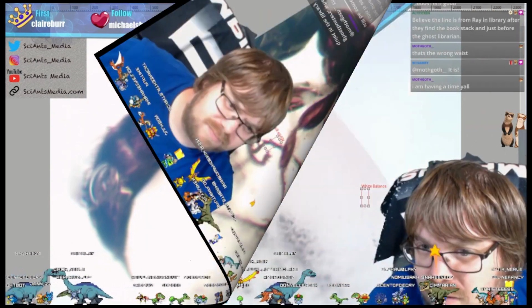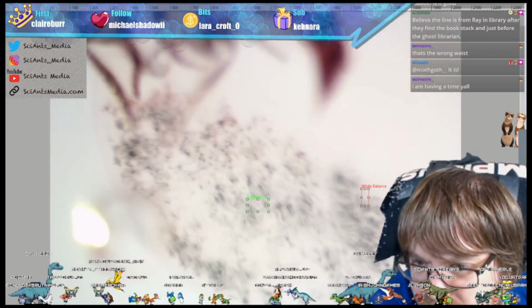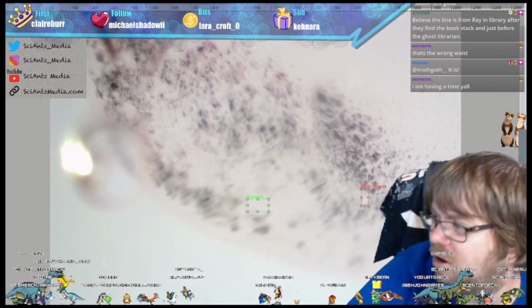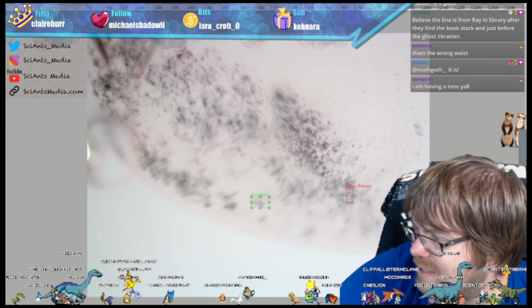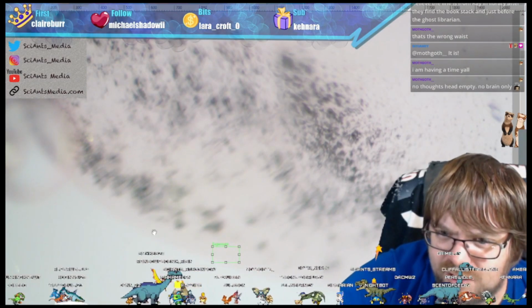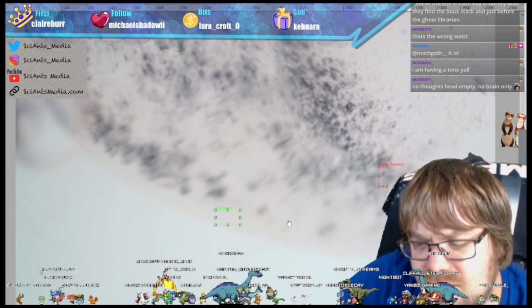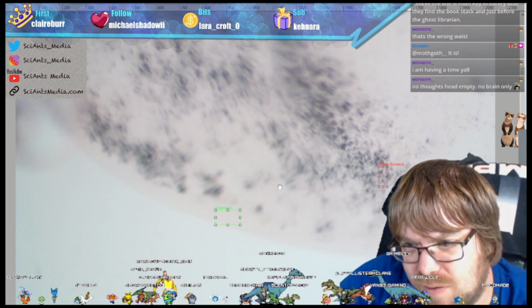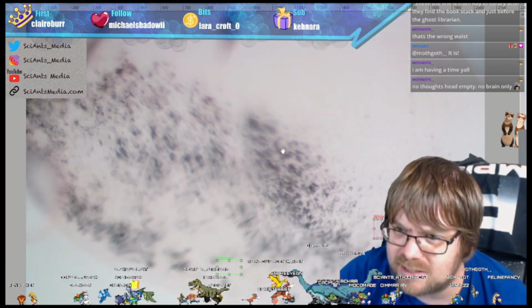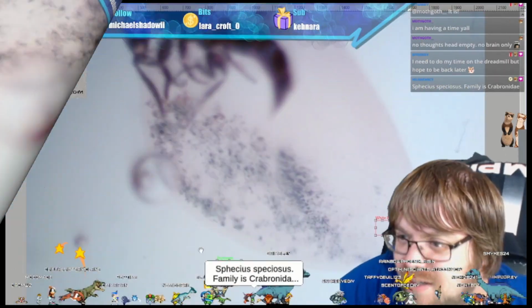Actually, get that information. So let's quickly look at this too that we suspect might be pollen. And again, part of why I had a sneaking suspicion is, do you guys see the discoloration between the two points? So like right here, there's a line, and on that, in between, up and down on the line is where the pollen's actually located. So that's why I have a sneaking suspicion that that's what this is. Because of the discoloration, and then all these granules in here, and it's only localized to this region, immediately surrounding the wasp.